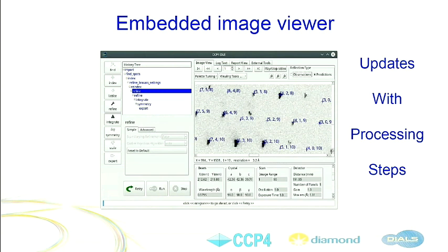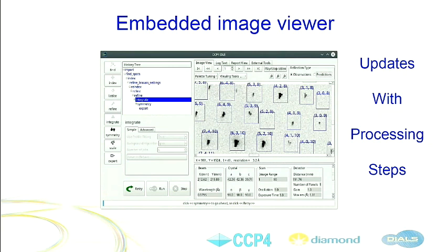You can see predictions shown as crosses instead of rectangles. With the predictions you can see, for example, why a reflection was not predicted — it's the first place you should normally look in the Image Viewer. For example, predictions may show missing spots where indexing missed some spots. When you do integrate, it shows you the entire rectangular area needed to do integration: a bigger area to calculate the background, and closer to the center, the area to do proper integration by subtracting the background. You can see why something was not integrated — it shows you the debugging tools you need.